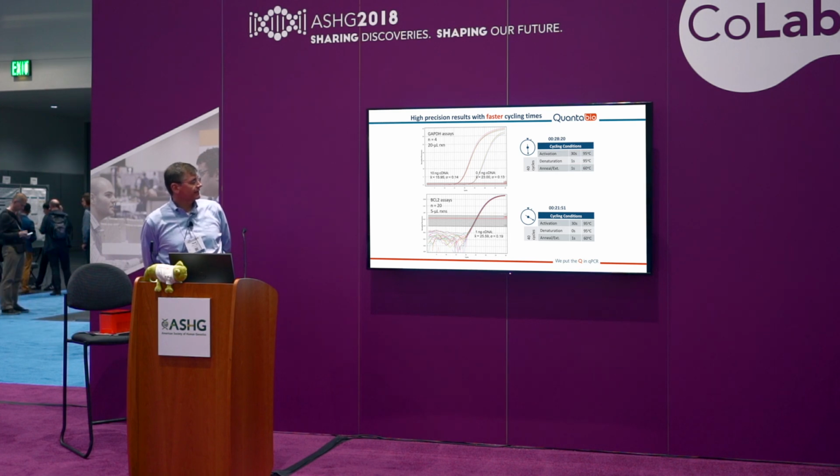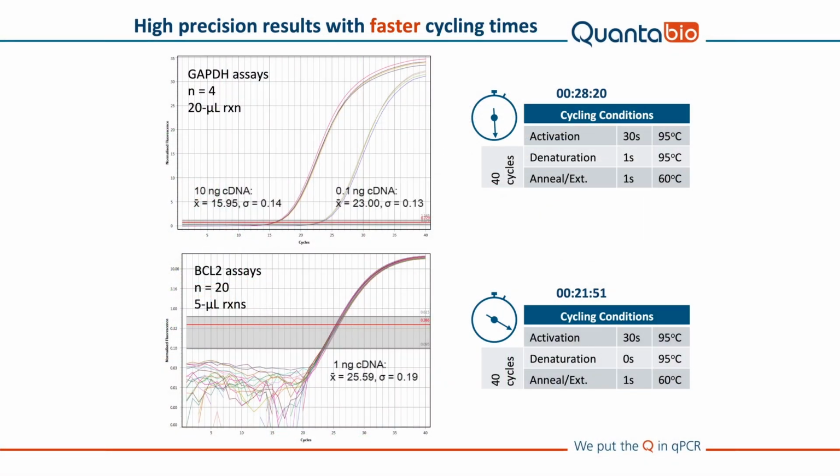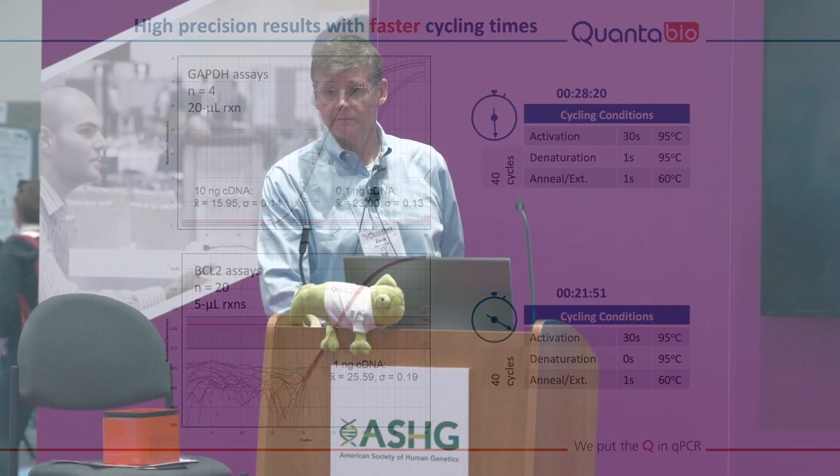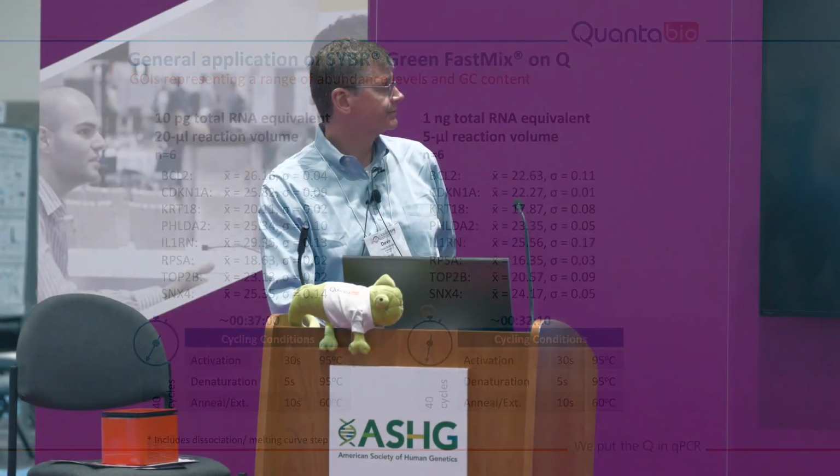This again extends it to 2 other assays. For GAPDH, we looked to see how fast we could push it, and we could get GAPDH down in a 20 microliter reaction volume to about a 28-minute runtime. If we further reduce the sample volume so that you have more rapid sample equilibration, BCL2 was an assay that we could push down to about 21 minutes, again for 40 cycles, and this includes the dissociation or melt curve at the end of the qPCR. And you can see how tightly clustered all these replicate reactions are.